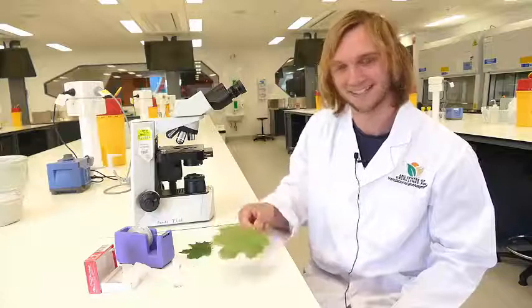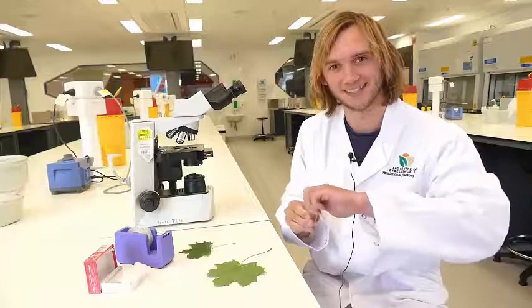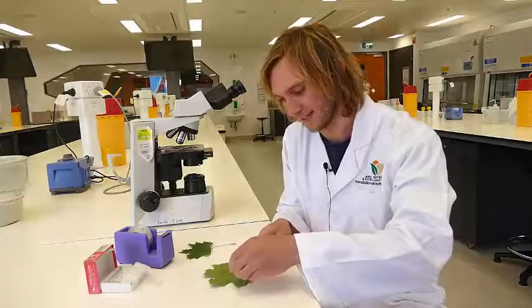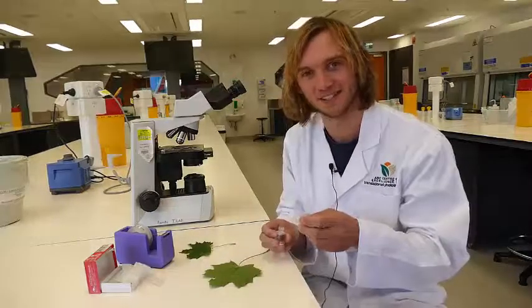First, take a leaf and paint clear nail polish on the surface of the leaf. You don't have to cover the entire surface — just a small section that you want to look at.